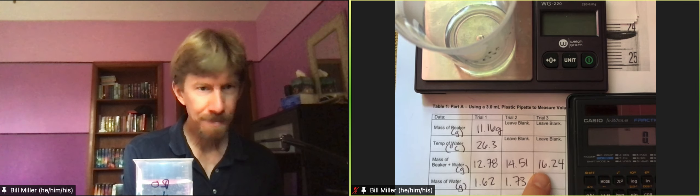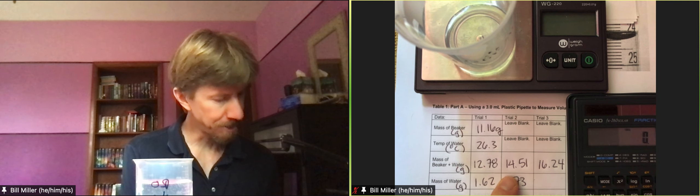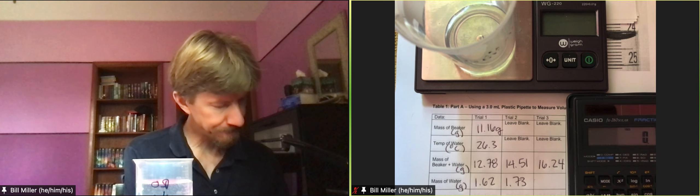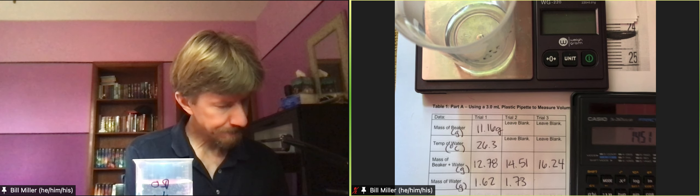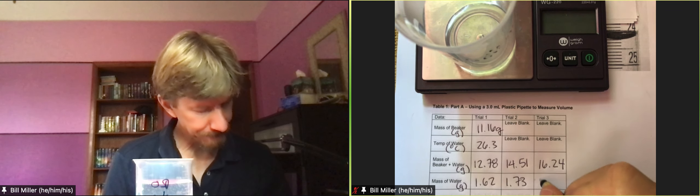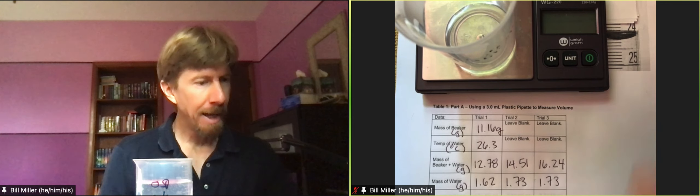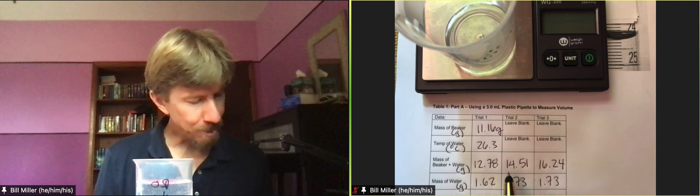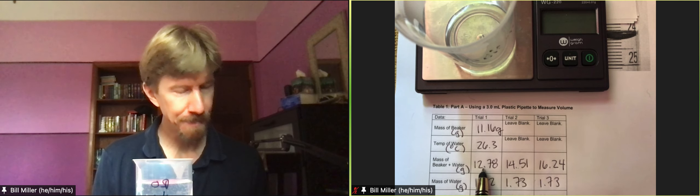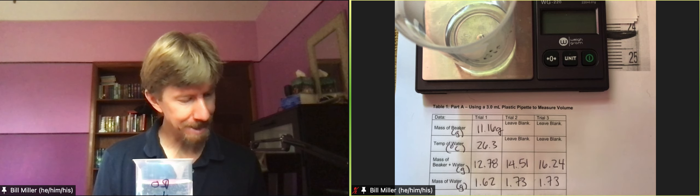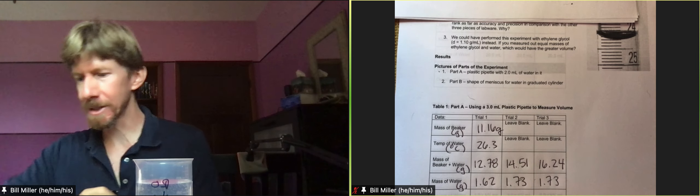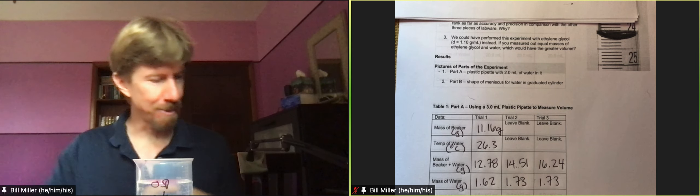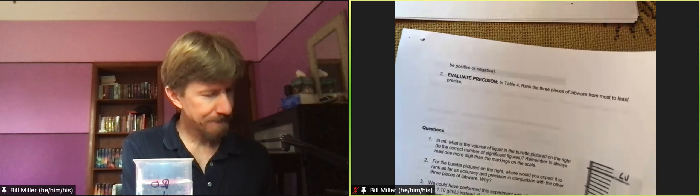Now the number that goes in this box here, 16.24 minus 14.51, 1.73. That's because when you don't empty it you have to go back to the previous number. What we'll see when we do the graduate cylinder is that we will empty it and so we will go back to just the beaker. But this is for not emptying it and this is how you figure out, well, so this is most of table number one.